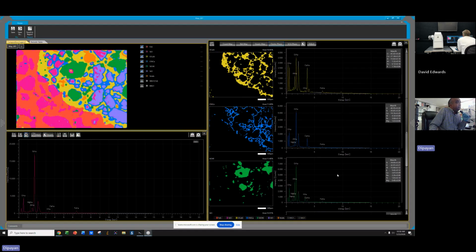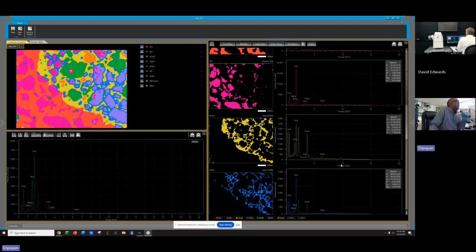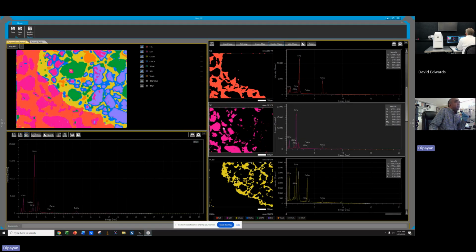Like, for example. Yes, we can do that. This one, quartz. No, not this one. So I don't need to be worried about quartz. Always, if I have silica, well, the problem is my samples can have so much variability. Yeah, and that's where the problem comes. Quartz doesn't have any iron.